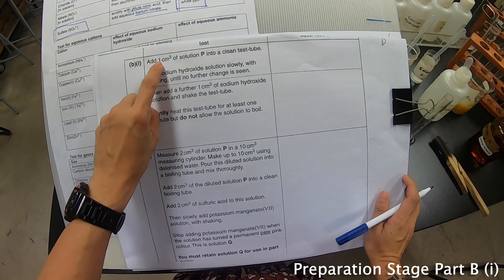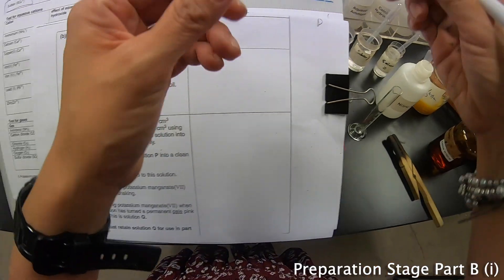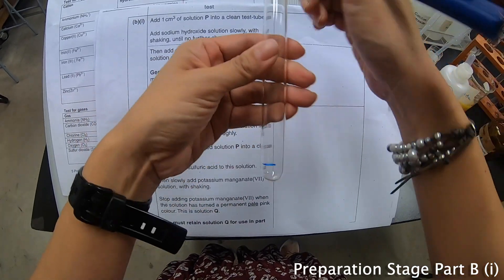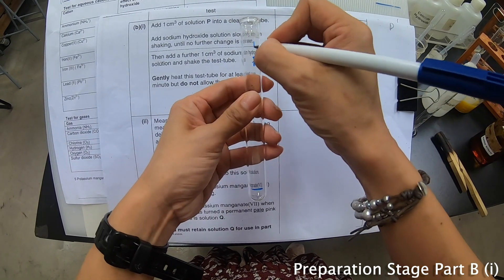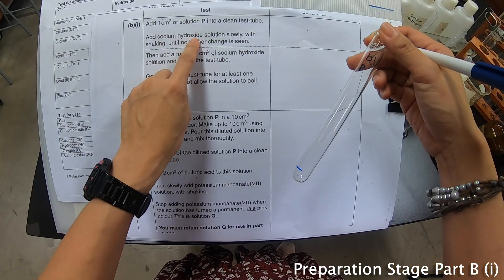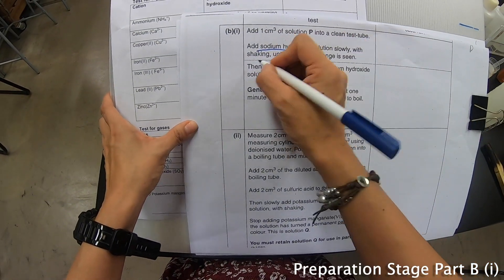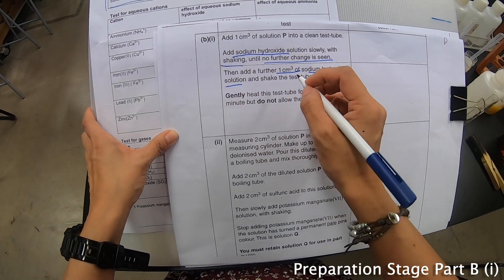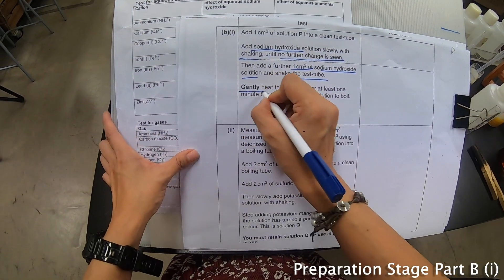This part says: add about 1 cm³ of solution P into a clean test tube. So same thing, 1 cm³, but this time round it is P. Remember to label it, and they say add sodium hydroxide slowly with shaking until no further change is seen, and add another 1 cm³ of sodium hydroxide solution with shaking. Then gently heat.